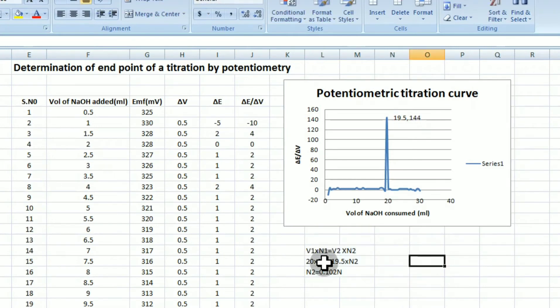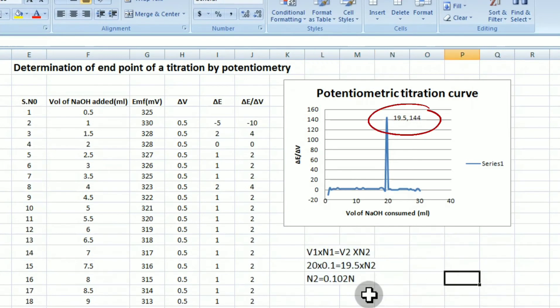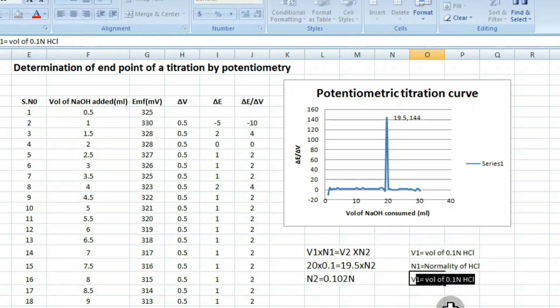When you put the cursor at the tip of the peak, you can see the volume that is required to get the endpoint. That is, the particular graph shows 19.5 ml. When 19.5 ml of sodium hydroxide has been consumed, the endpoint has been reached. It is 19.5 ml as shown in the curve.